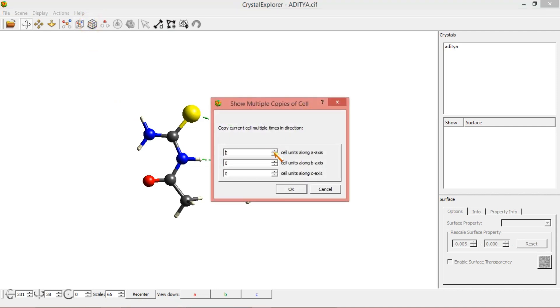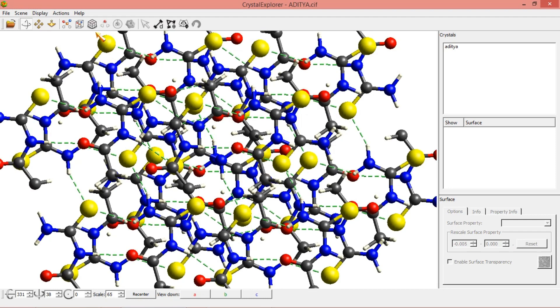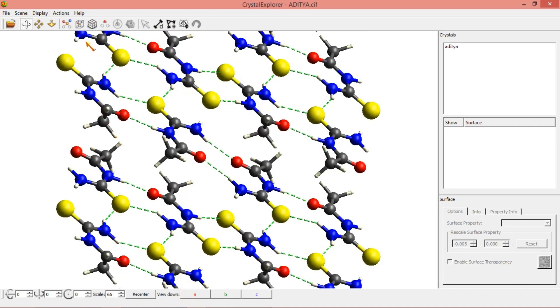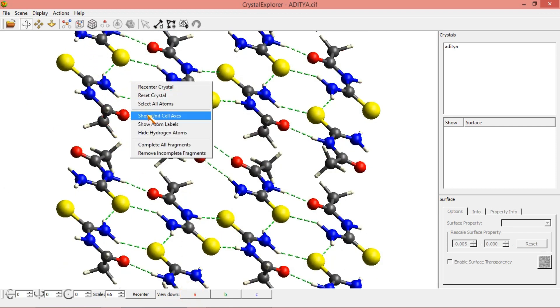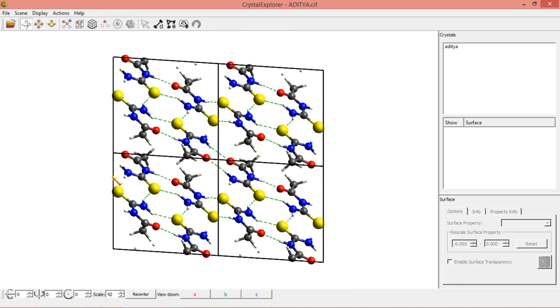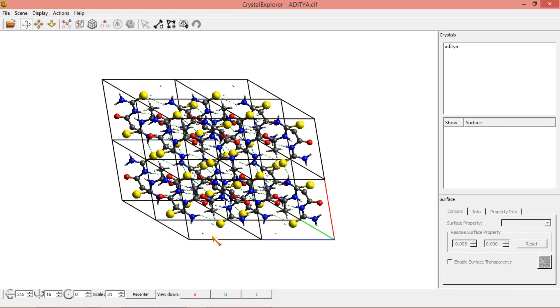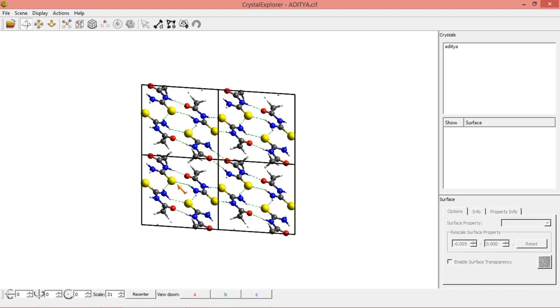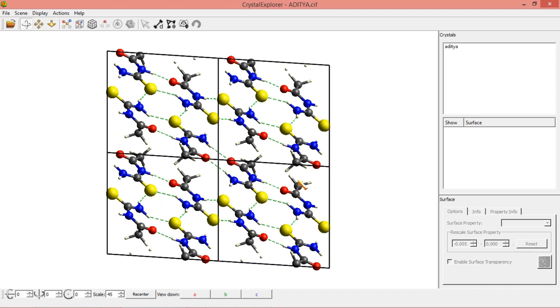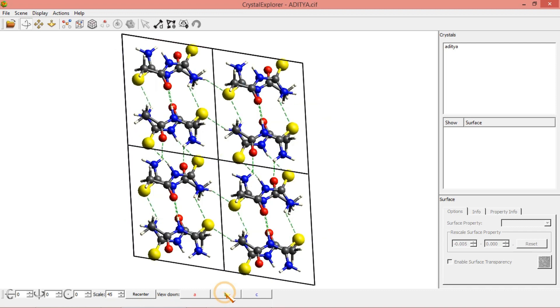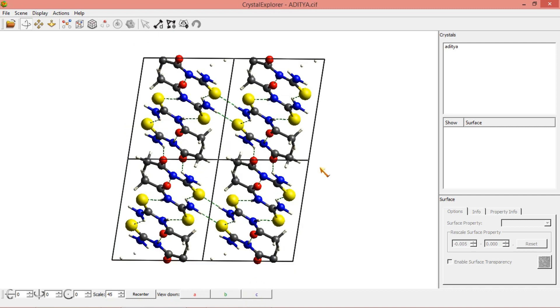I am increasing along A axis 1, B axis 1, C axis 1 — each by 1. You can see along the A axis how the structure looks. I will draw the unit cell to show it. This is the packing structure along the A axis showing inter and intramolecular interactions. Next, along the B axis — this is how inter and intramolecular interactions appear. And along the C axis, this is the way we can see inter and intramolecular interactions.